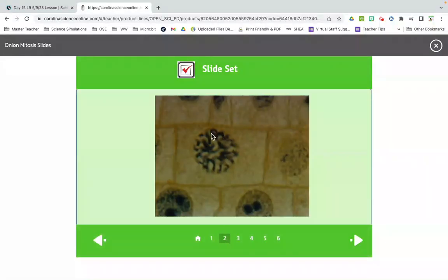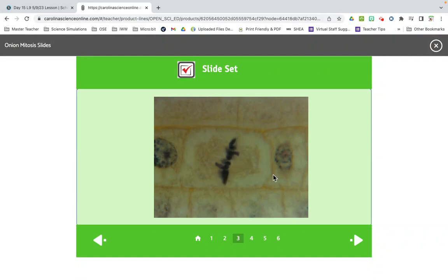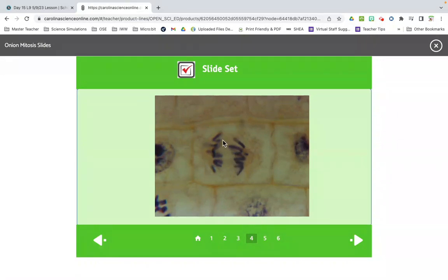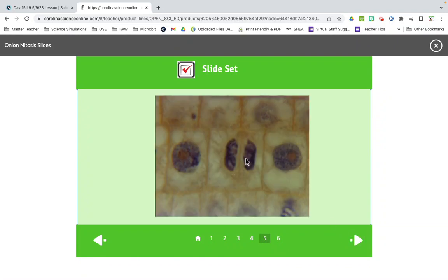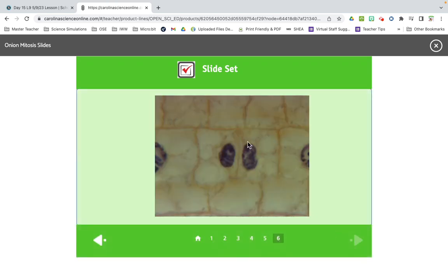And what we see happening is this: the center part starts breaking down, forms a line in the center, and starts pulling apart to either side. Those strands group back into these bluish objects here, and you can see there's another cell line forming between them. And then finally we're back to our blue dots. So where there was one cell before, we now have two cells.